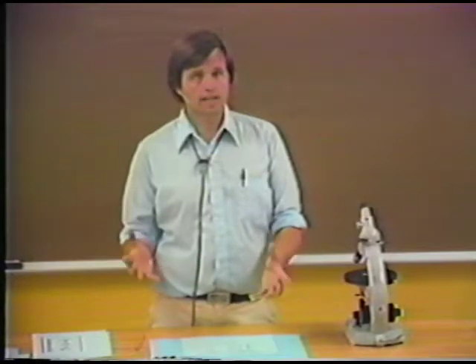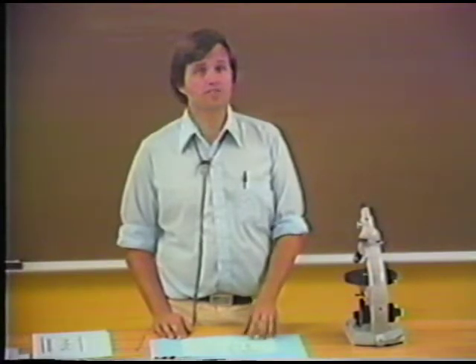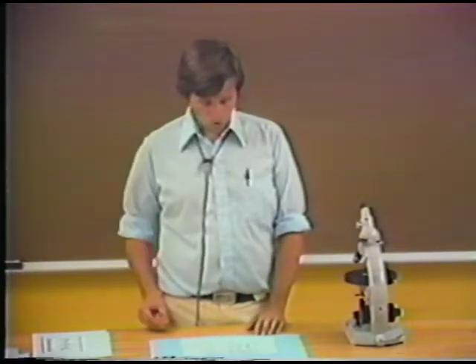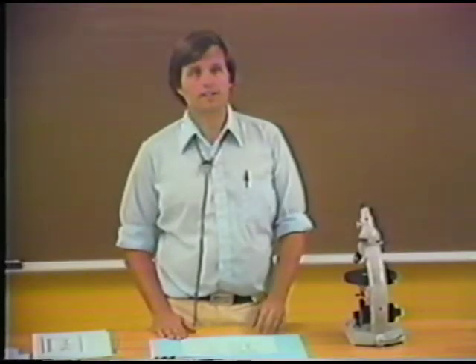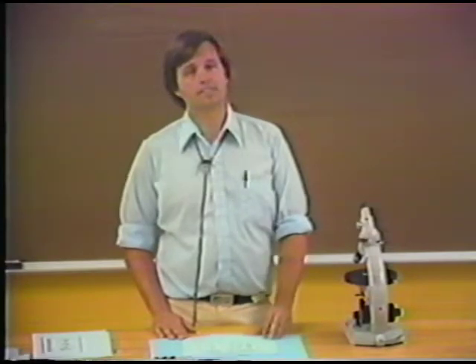The test is the same once the grain is properly oriented. But after we've tested the O-ray, we need to be able to test the E-ray, and knowing the sign of the mineral then tells us whether the epsilon refractive index is going to be less than or greater than the omega refractive index. So this is very valuable information to determine the sign early in this particular game.